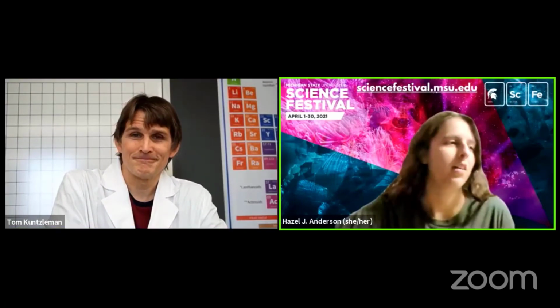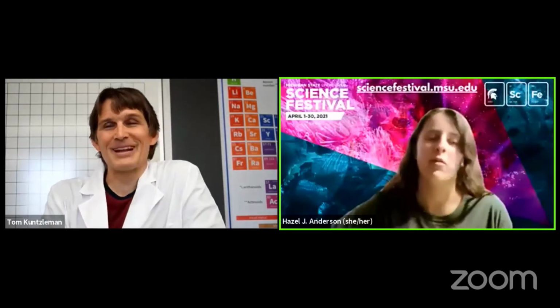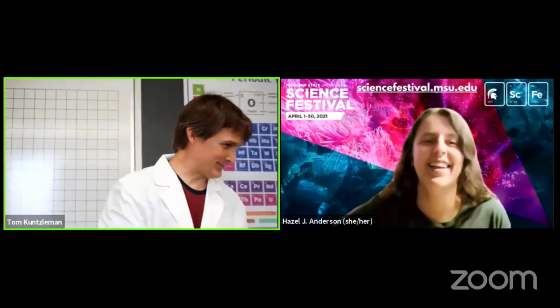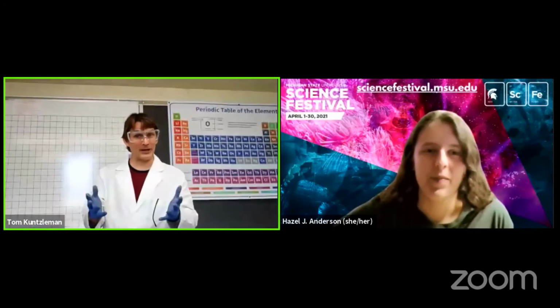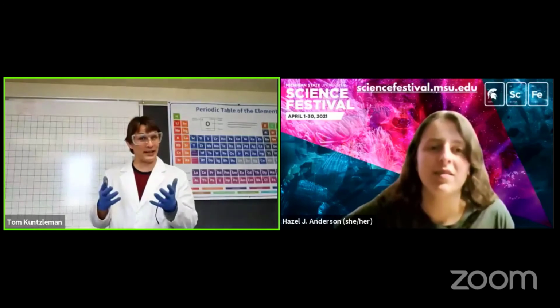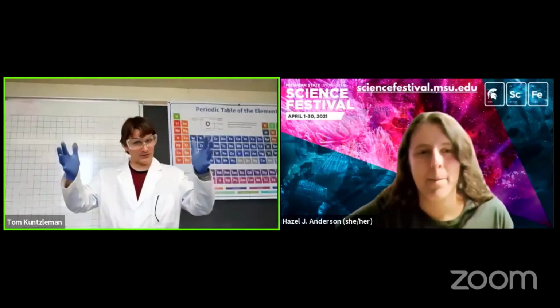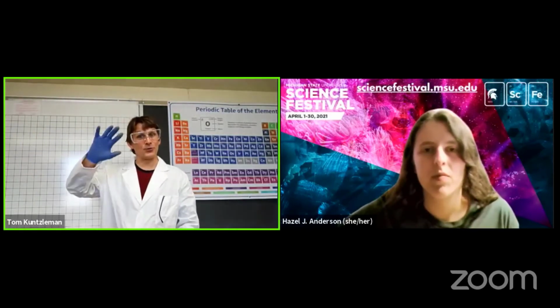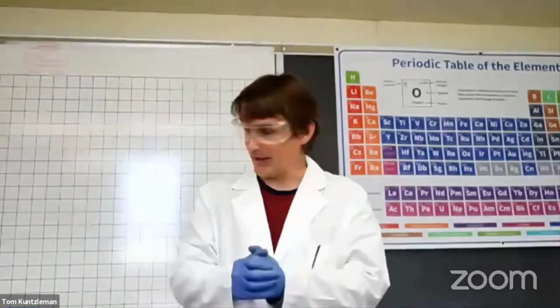Yeah, that's awesome. So someone asked a really fun question: if we torch the Statue of Liberty, will it shine? That's a great question. Let's try it. Let me show you why. Earlier today, I did some experiments on pennies to show why the Statue of Liberty is green. That happens because the copper on the Statue of Liberty reacts with components in the atmosphere to form green colored compounds, the copper 2 ion.